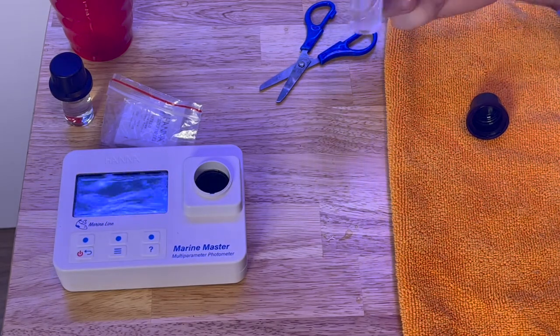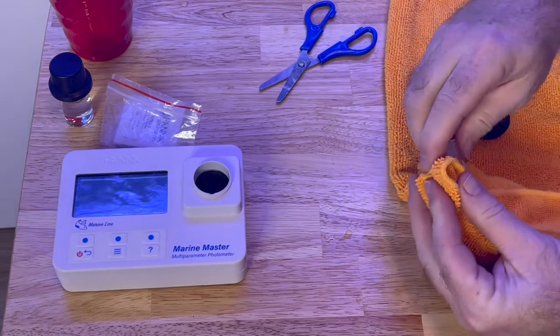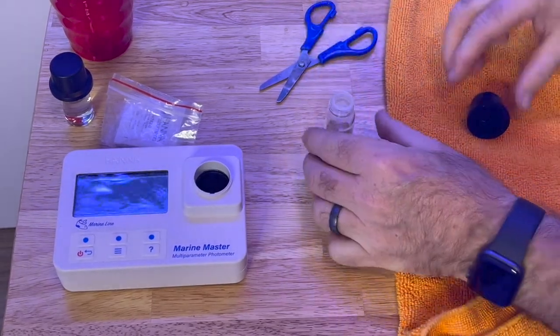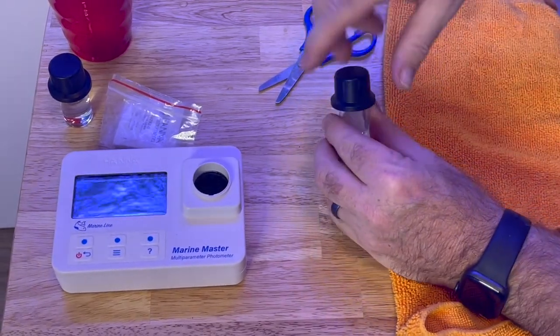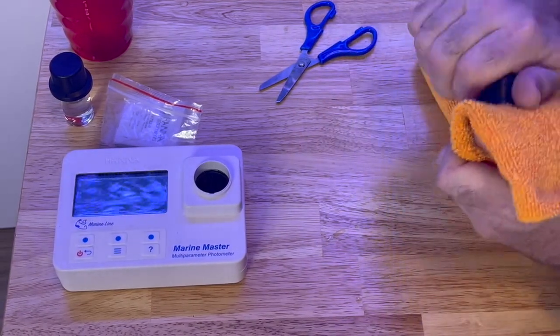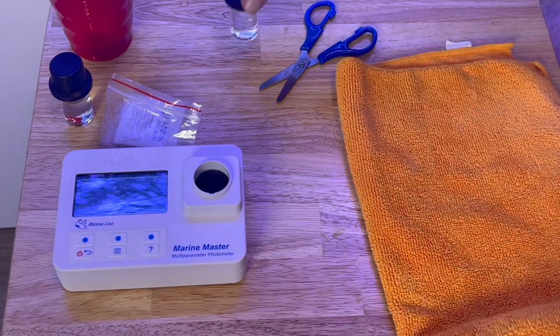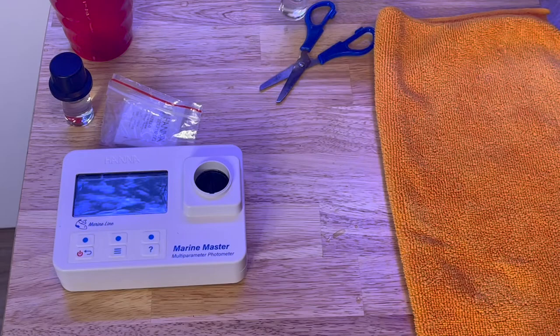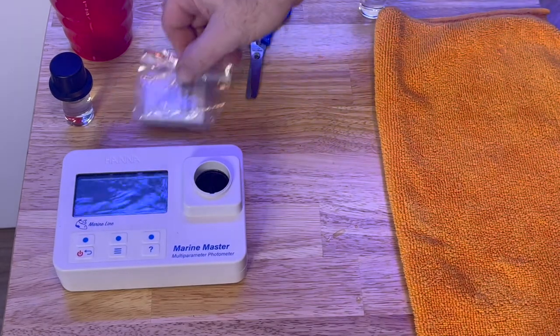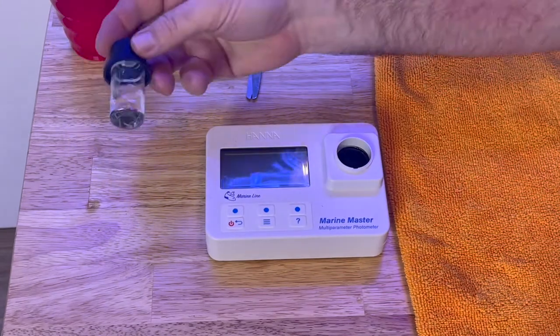That's been two minutes — I timed it and my reagent is ready. I'm going to put the cap on and wipe it down again because I want to make sure there are absolutely, positively no fingerprints on there that will skew the reading. I like to keep the reagent cuvette to the right of the checker and the sample to the left of the checker.